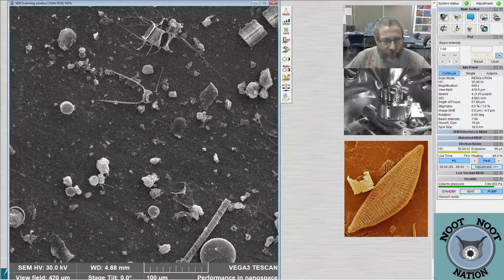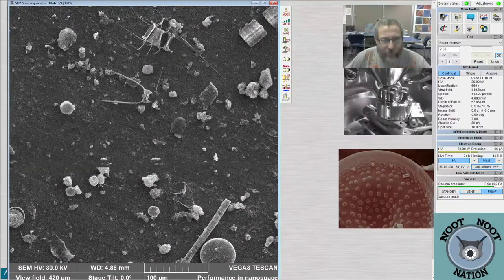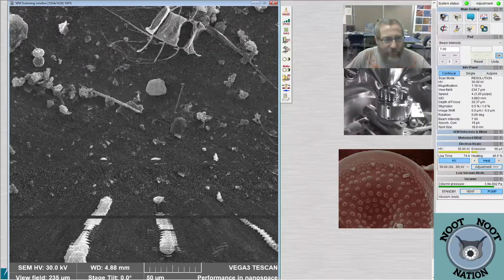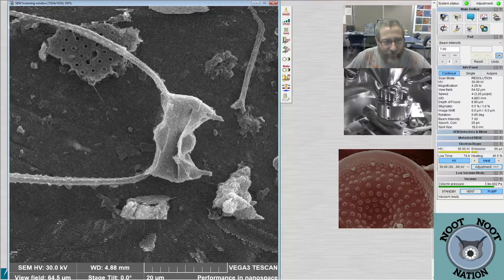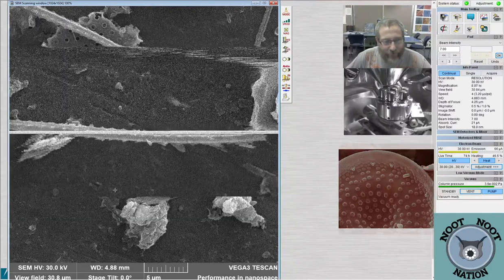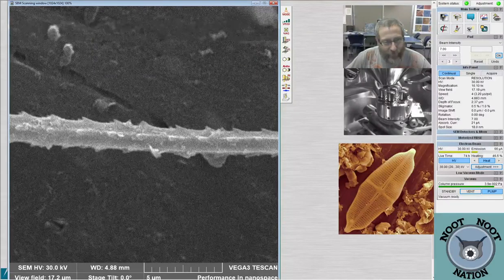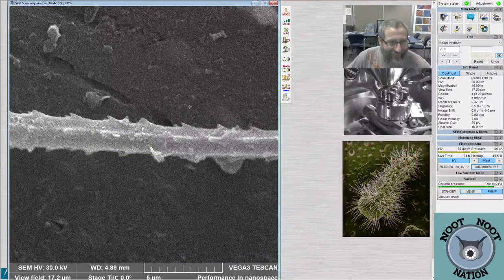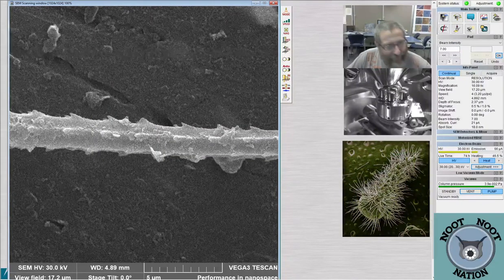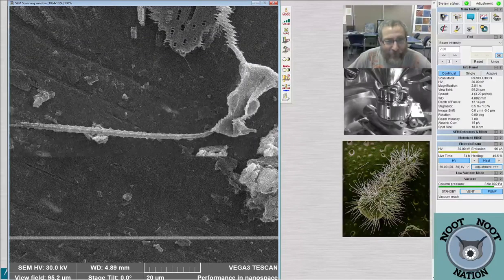There's a giant Chaetoceros right there. Monster one. Ooh. Oh, and there's something up here. It's got the nubbins. You can really get a sense of the jagged spines that they have. They look like barbed fence wire, barbed fence posts, right? Yeah, it screams, "Don't eat me." I mean, that's probably what I would scream if I were plankton, too, to be honest.